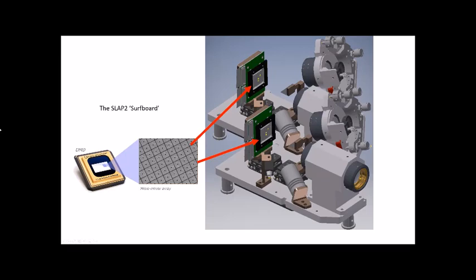And so that allows us to turn individual pixels on and off, but cancel out the problematic diffraction effects. This only works for efficiency reasons at specific wavelengths, and we had to design this around a specific wavelength. Due to other constraints, that wavelength is 1,030 nanometers, a wavelength at which we can get extremely powerful lasers, which are also needed for this style of approach. Because we basically need to put onto this DMD, in any given pixel, enough laser power that we would be doing 2-photon excitation in the sample with just that one pixel. And then we turn each pixel on and off, depending on whether or not we want to use it in any given sweep.